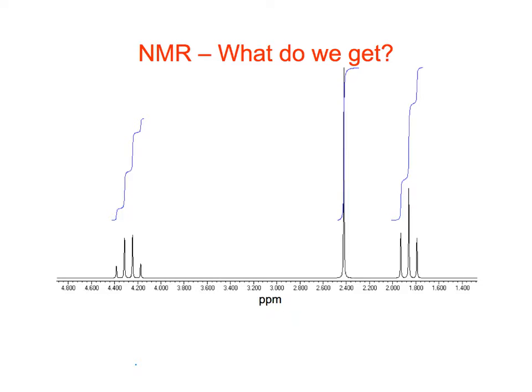Probably if you run very much NMR in the lab, it's probably a common contaminant. Yeah, ethyl acetate, right? Yeah, that shows up all the time. My stuff is methoxy, super clean peak at 3.9, and so that's how I know I'm at the end of my methoxy peak, so I'm on some substituents. Yeah. Okay, so if we look at the spectrum though, what parts of the spectrum give us information?